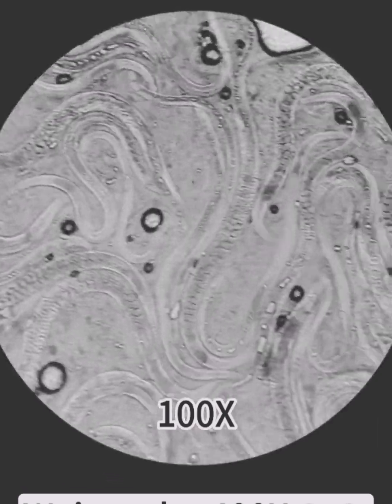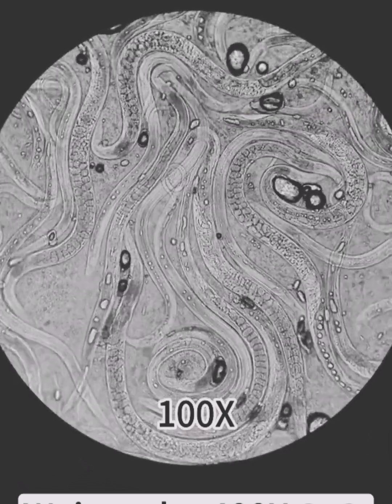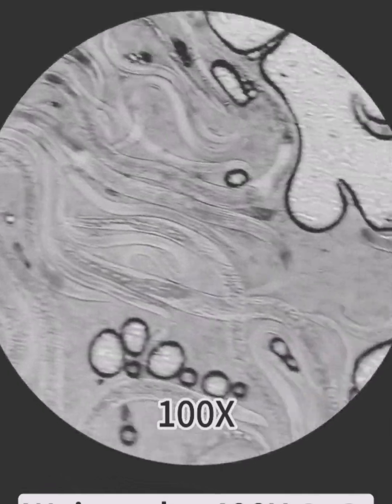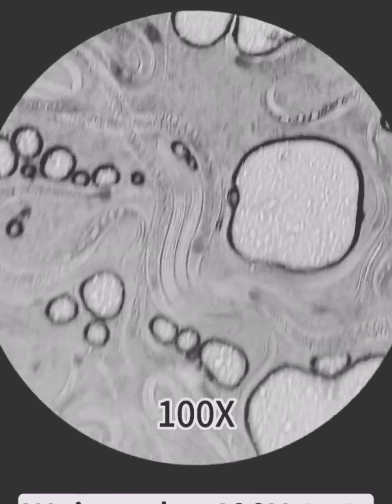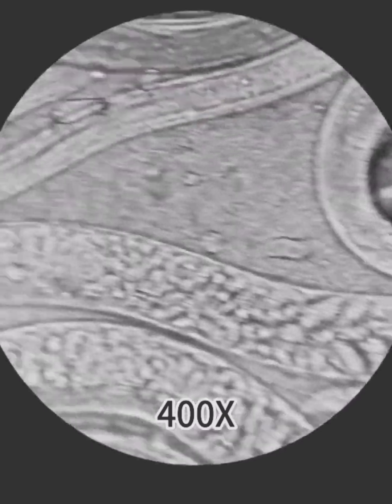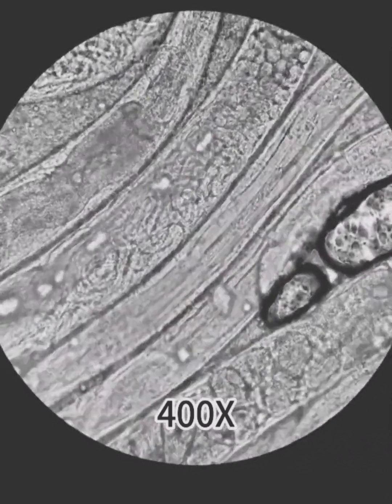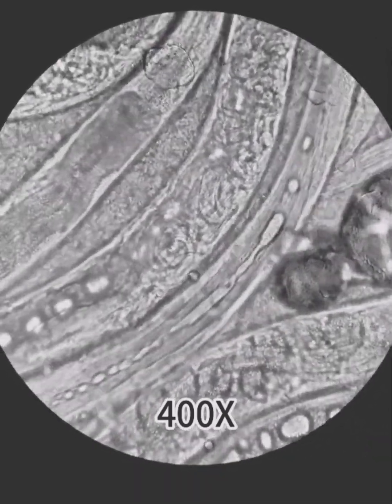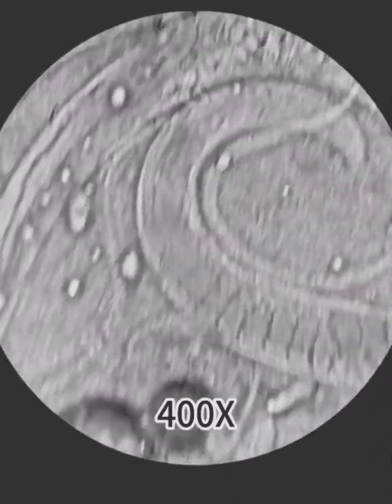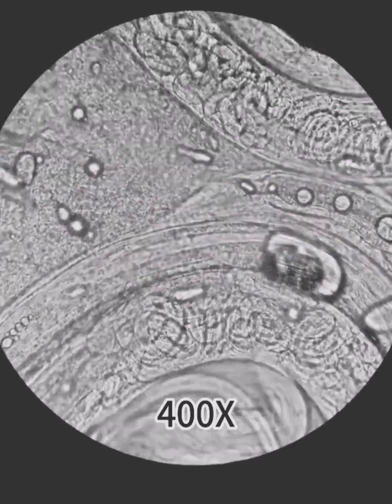As you can see, these are worms or bacteria that are usually found in cat saliva. So let's see how it is under 400 times magnification. These are the saliva and these are the organisms that are found in the saliva.